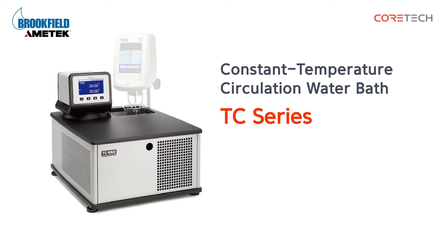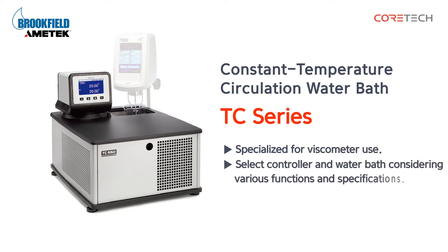This product is a circulating water bath specialized for viscometers. Select the controller and water bath considering the various features and specifications.